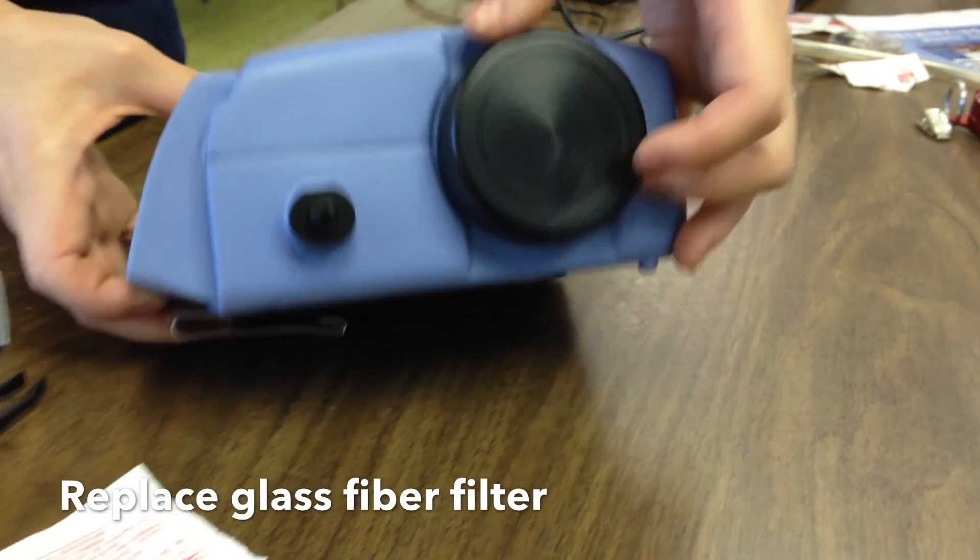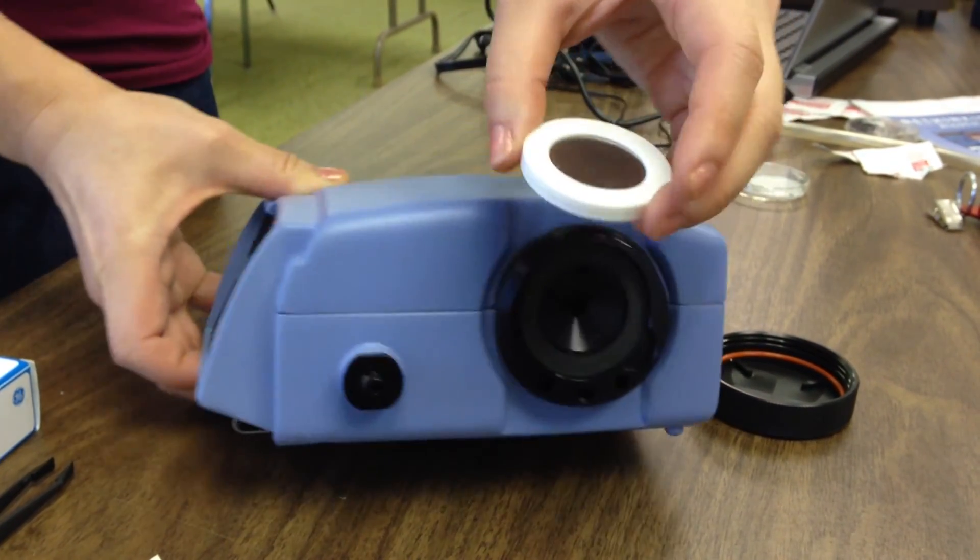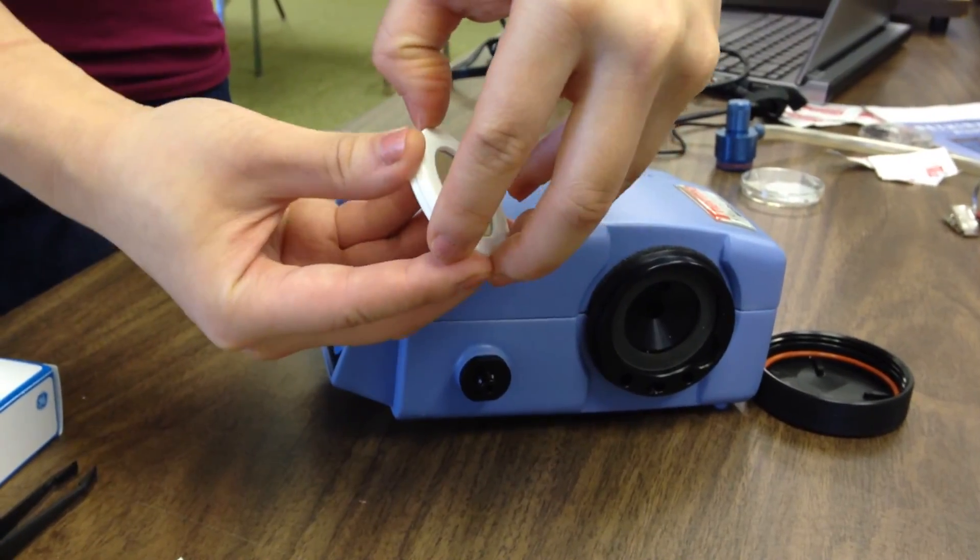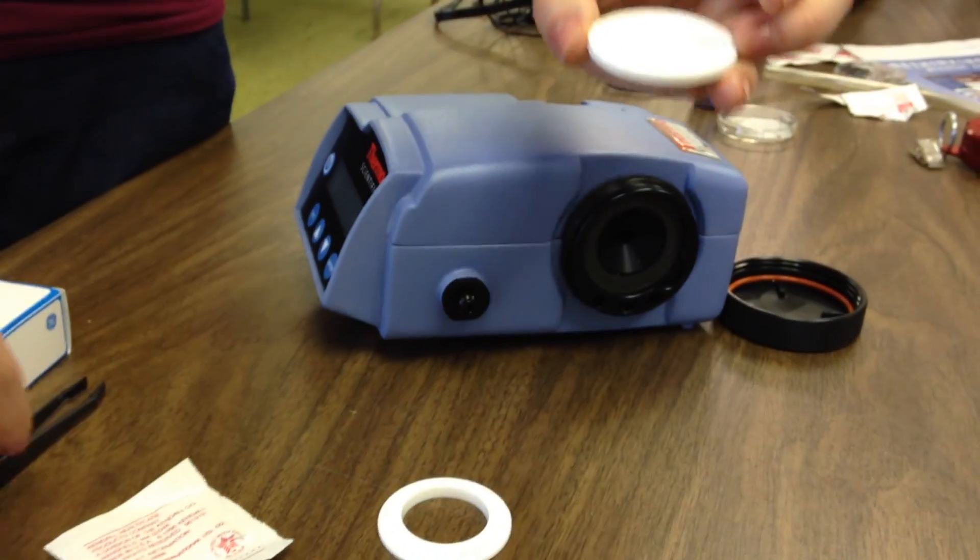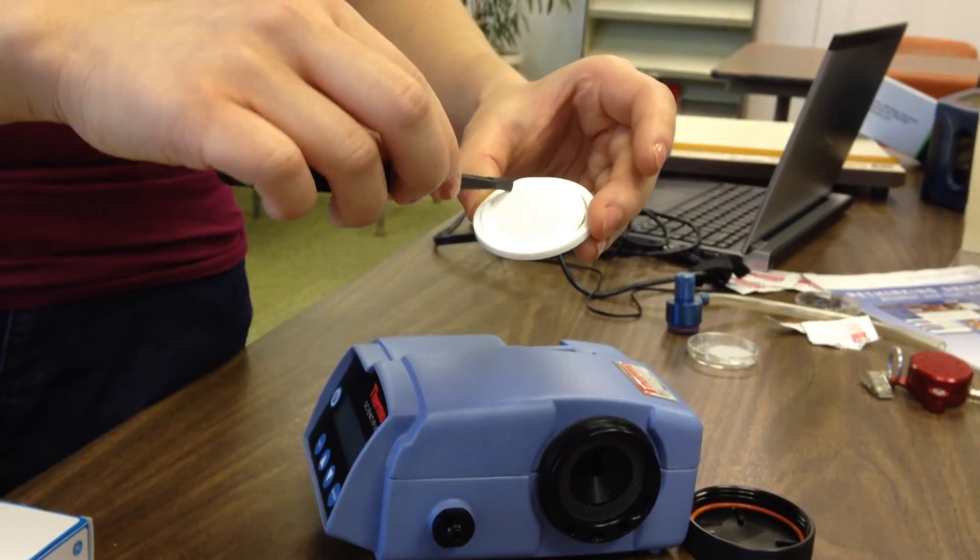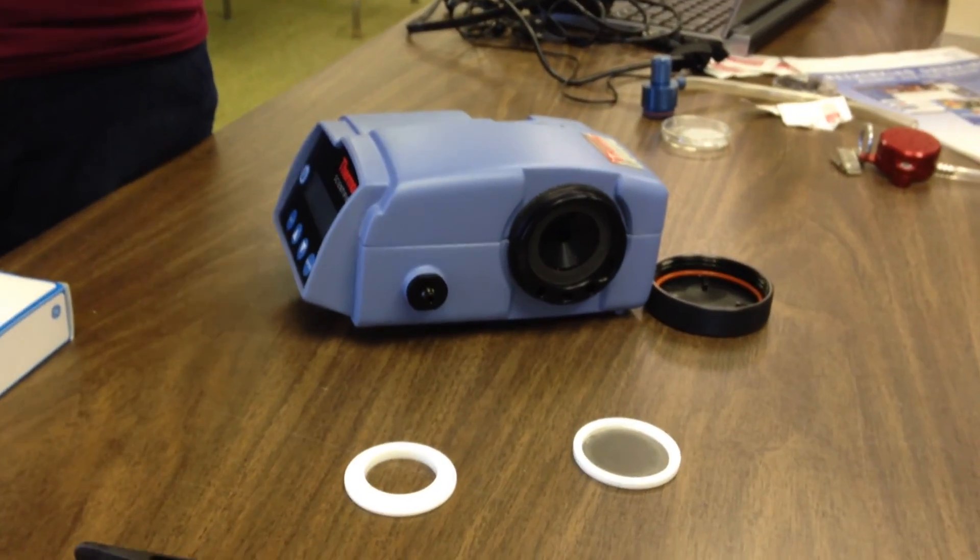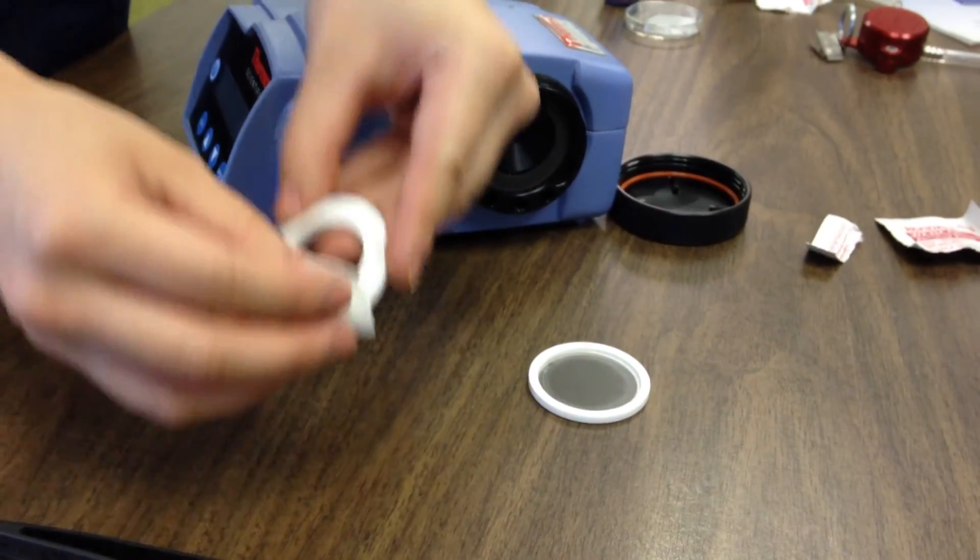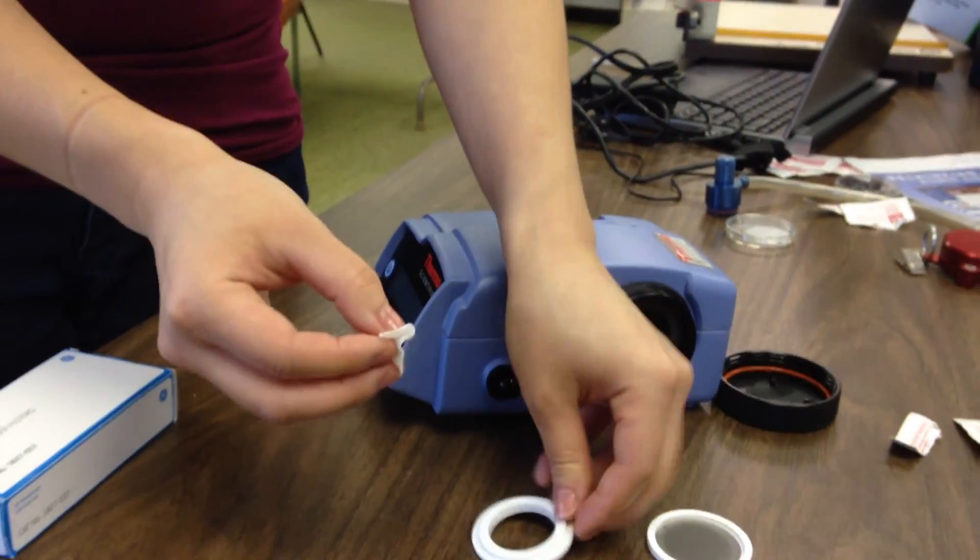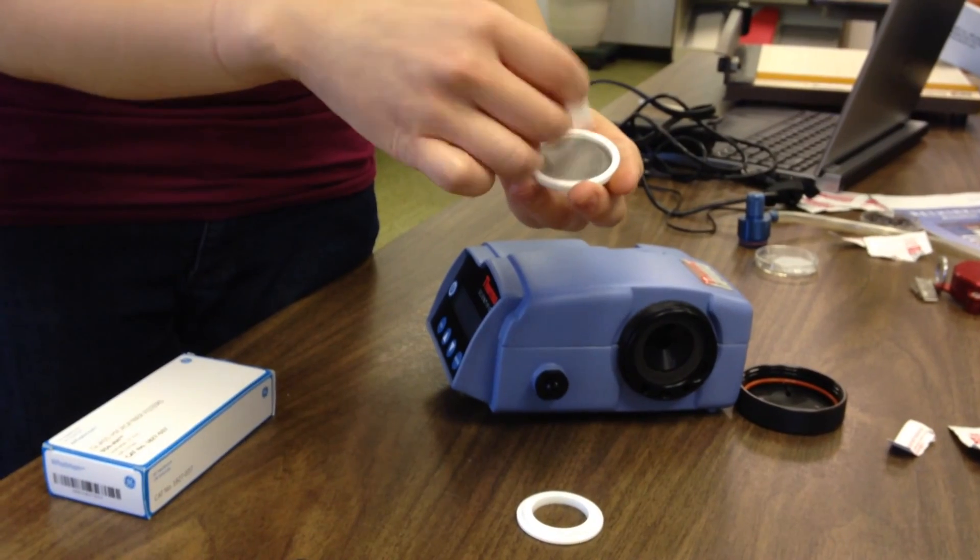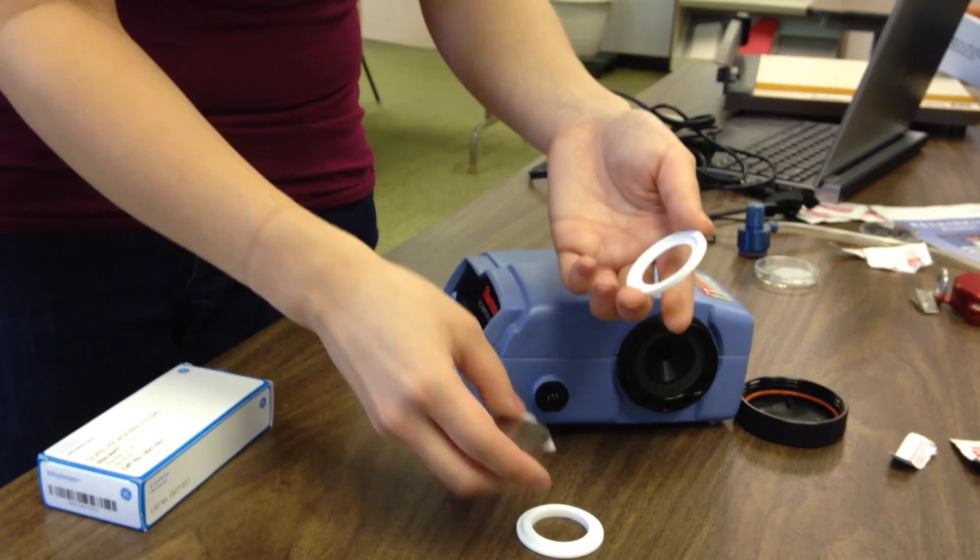Before air monitoring, the glass fiber filter must be replaced. Unscrew the cap on the side of the PDR and remove the filter holder. Remove the old glass fiber filter with tweezers. Clean your filter holder by using an alcohol prep pad. Thoroughly wipe the top and bottom cassette rings as well as both sides of your filter support screen.